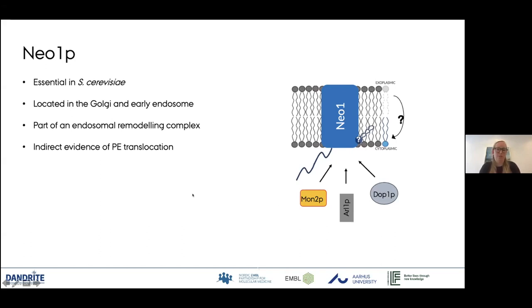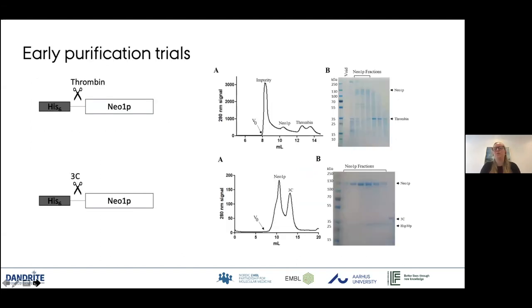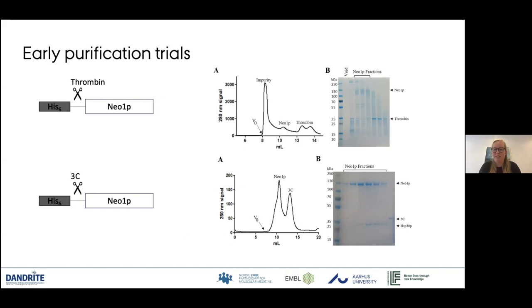After all the talks yesterday, I looked back at my very early purification trials — also after hearing how popular the His-tag still is — just to show that it doesn't necessarily work for all projects. When I started around five years ago, we had a His-tag cleavable by thrombin, but I had no specific defined band, more like a smear. It turned out that thrombin was very trigger-happy with Neo1, likely because it was very unstable. Even when switching the protease, we could never get rid of a heat shock protein — an endogenous yeast protein that kept co-purifying for no physiologically relevant reason.